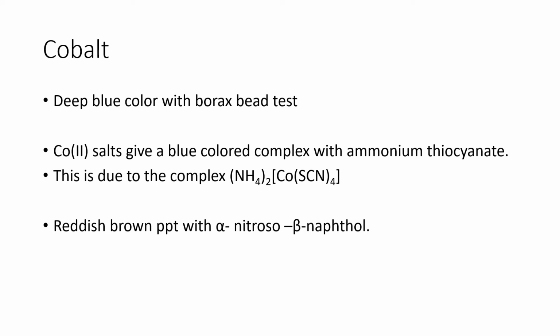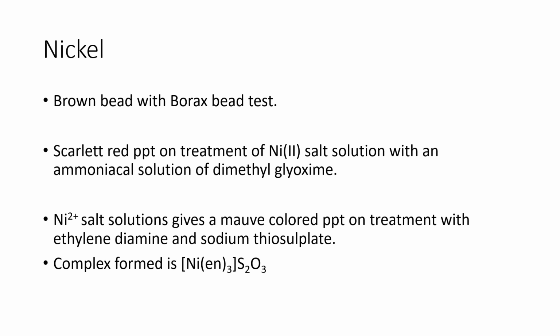Cobalt, the next metal, it gives a deep blue colored bead if the borax bead test is performed for a cobalt salt. On treatment with ammonium thiocyanate, an aqueous solution of cobalt, where cobalt is there in the +2 oxidation state, will give a blue colored complex. This is due to the formation of the diammonium tetrathiocyanato complex of cobalt. A reddish brown colored precipitate is obtained for a cobalt salt with alpha nitroso beta naphthol.